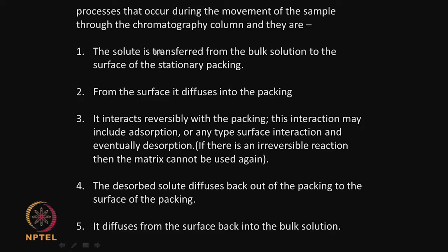So, it is moving from the bulk to the surface of the packing material or the stationary phase. Then it could be getting desorbed from the packing, away from the surface, and then moving into the bulk. All these are retarding your solute passage. So, it becomes slower and slower. The more it slows, the longer the retention time is. Each of the solutes has a different retention time, which is why the partitioning of this material takes place.